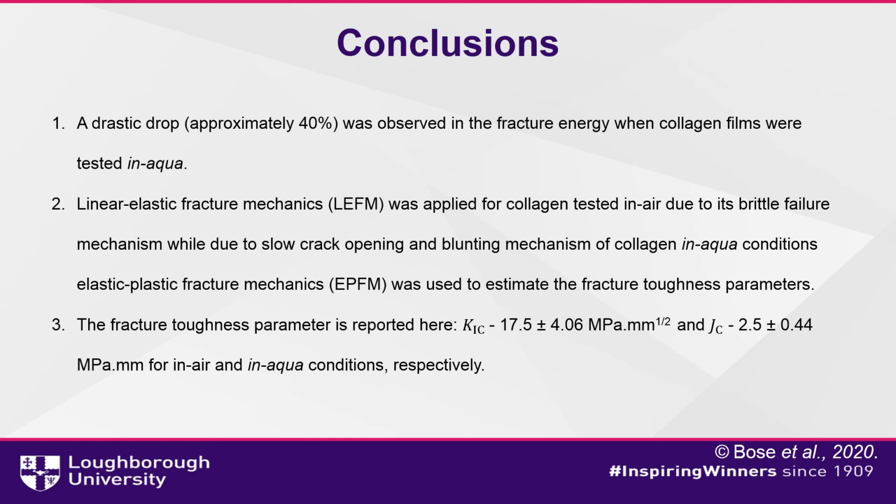Third, the fracture toughness parameters are reported here. K1C about 17.5 megapascals into millimeter to the power half for in-air specimens, while JC is about 2.5 megapascals into millimeter for in-aqua specimens.